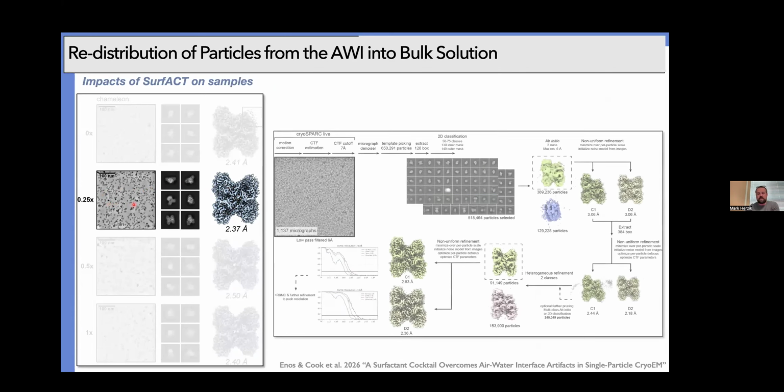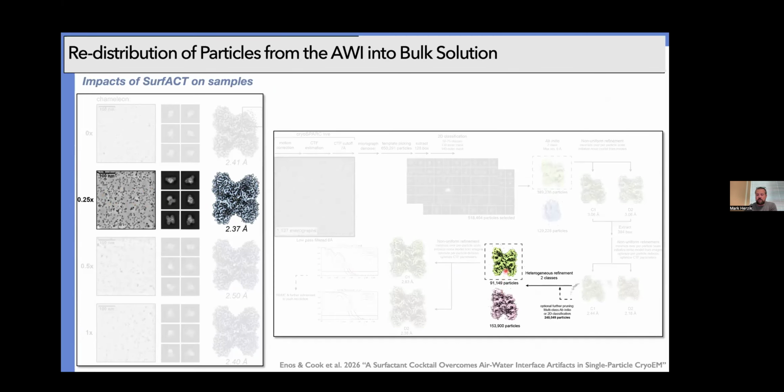And so what we noticed in our data processing is that moving through 2D classification into 3D, we can basically binarize our sample into one of two different groups: fully intact with an intact homotetramer, or again, one with that broken protomer phenotype. All right, so it means that it fixed in some cases, but not completely. How do we reconcile this?